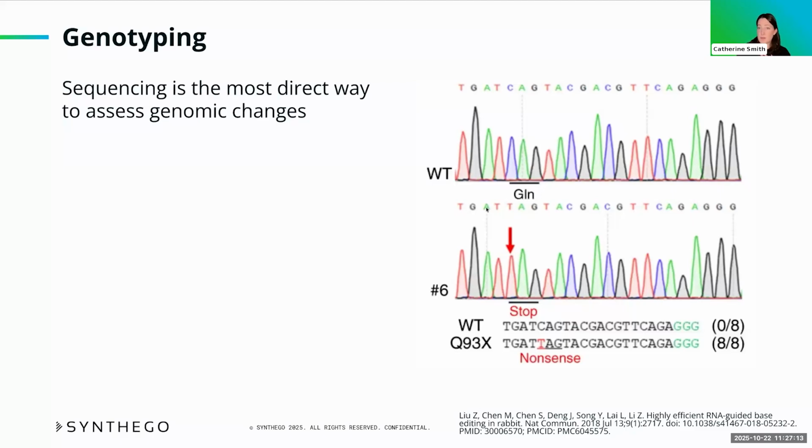As shown in these Sanger sequencing traces, this strategy allows you to compare your unedited and edited populations and see the edits that are present or not as a result of your base editing attempt. Sanger sequencing, as shown here, is fast, accessible, and very affordable. But if you prefer to use NGS for greater sensitivity, there are analysis options for both sequencing strategies.